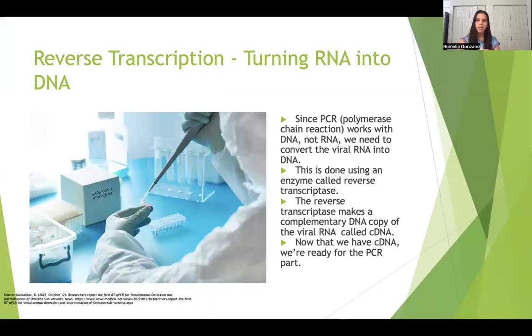Okay, so the next step is reverse transcription. Here's what the RT in RT-qPCR stands for. RT stands for reverse transcription and it's an essential step. The PCR process only works with DNA, not RNA. But remember, as I previously said, the genetic material in the virus is inscribed into RNA. So we need to convert the RNA into DNA. To be able to do this, scientists will use a special tool called reverse transcriptase, which is an enzyme.